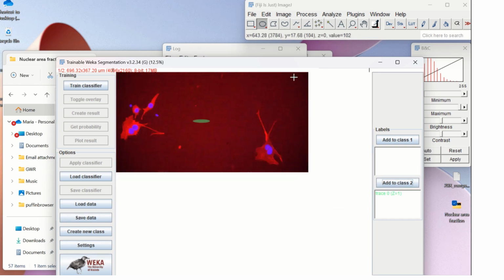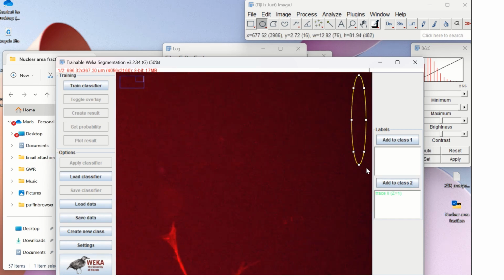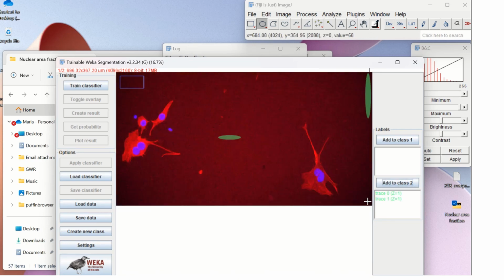Then I'm going to go to all the corners and draw a little circle right there, add that to background, and this to background, all the corners. Now the more area that you color in, the slower your computer will be, because a lot more memory is required. Basically I have all the background, I think.